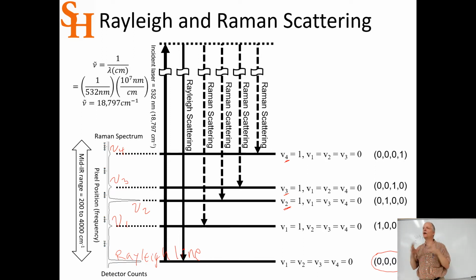So in benzene, what do you think is the largest peak that you could have? Whatever vibration could make the cloud change the most. Think about the benzene ring. If that ring breathes and gets bigger, that pi cloud gets bigger. And if that ring shrinks, that pi cloud gets smaller. So that's the largest scattering vibration in benzene for the Raman: the CC stretches, all 6 of them, symmetrically expanding and contracting. And because the whole cloud is oscillating, it can oscillate with light and scatter those photons very efficiently. And so that's what we see with the benzene.